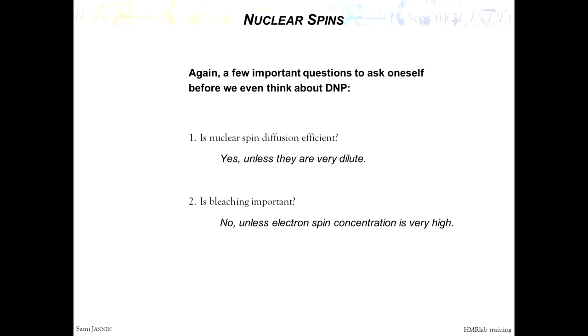And that's why Gioiosa came to us, because he tried with trityl direct and he said, we couldn't manage to do it, so we have to do CP. Because then we have a lot of protons, we can polarize, and then we can do CP on the very low abundant carbon-13 spins. But in principle, for protons, we always have 10% of water. I mean, spin diffusion is super fast. So we will assume that spin diffusion is fast in the rest of the lecture.